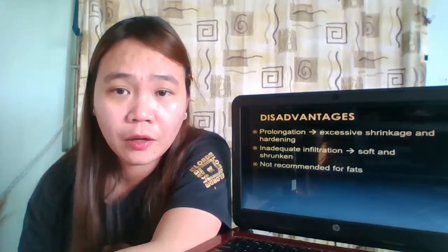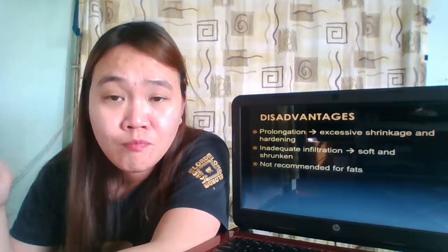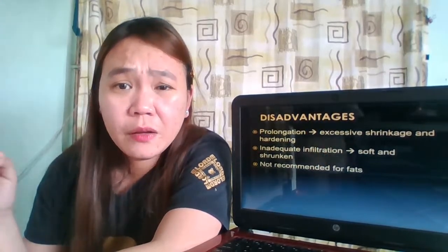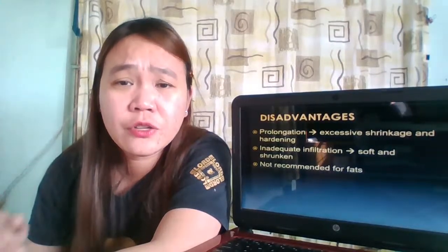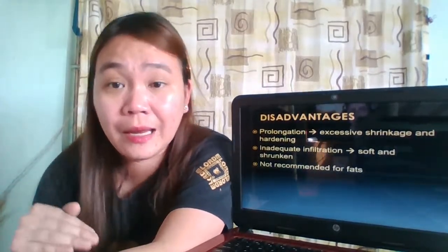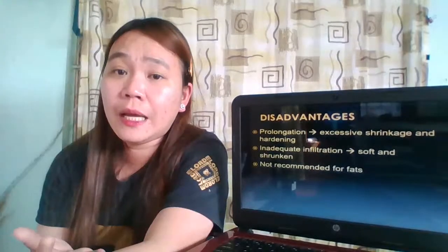How would we know that they are compatible? They have to be miscible with one another. Particularly, your paraffin should be miscible in the clearing agent. Otherwise, it will not be able to replace your clearing agent. Miscible, again, it should dissolve.